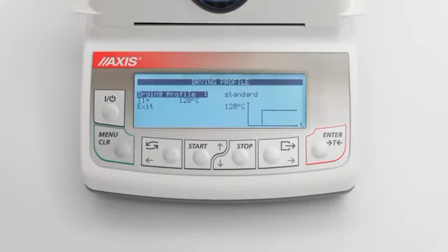Drying profiles are used to optimize the drying process by adapting its course to the properties of the tested material. Materials that oxidize or thicken on the surface require a slow or stepped profile. Resistant materials that are difficult to dry quickly may require a quick profile. The selection of the profile and its parameters should be the result of experiments carried out with the tested material.